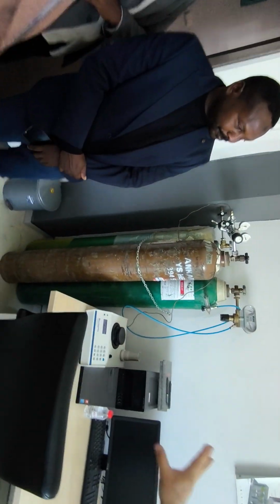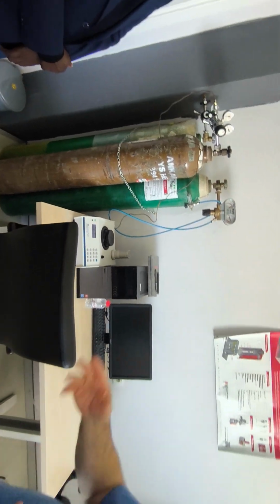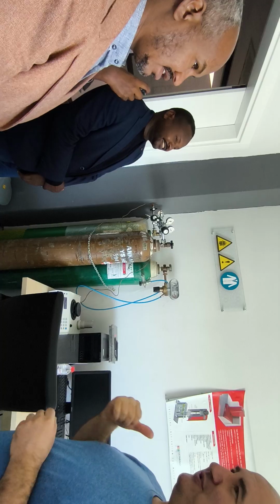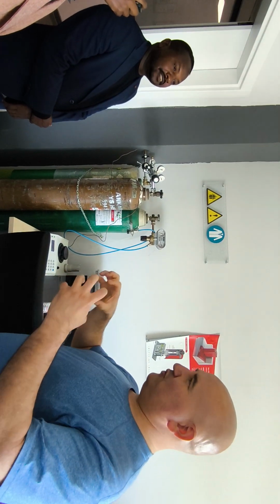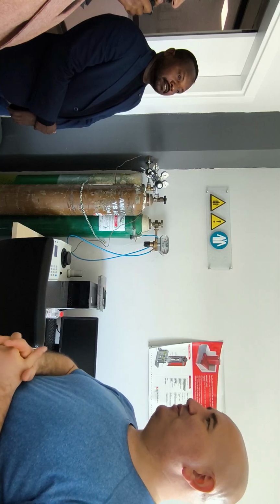And this one is for density. Density, yes. Step density and helium pycnometer. And I heard this morning in the news that helium will be a big problem. Yes. Because Iran is striking Saudi Arabia this morning, and it is one of the biggest helium production centers in the world. So we will have some problem with helium.